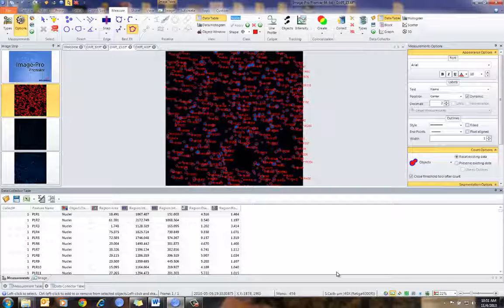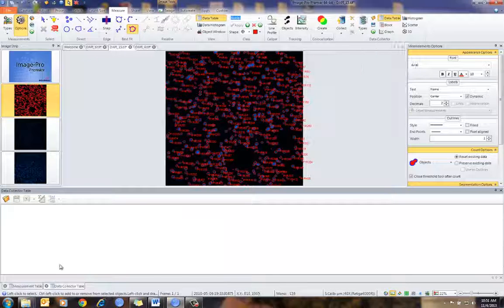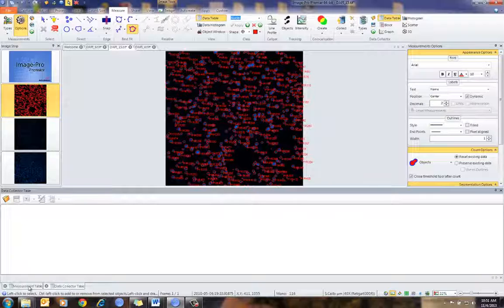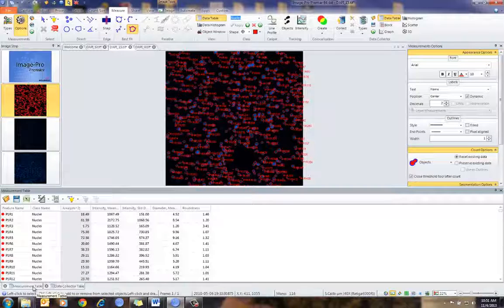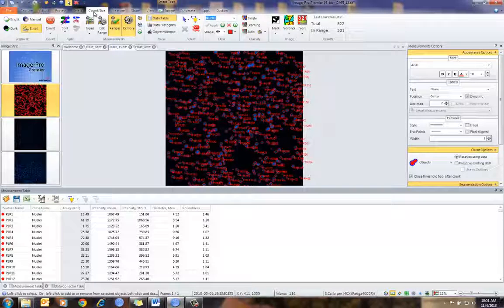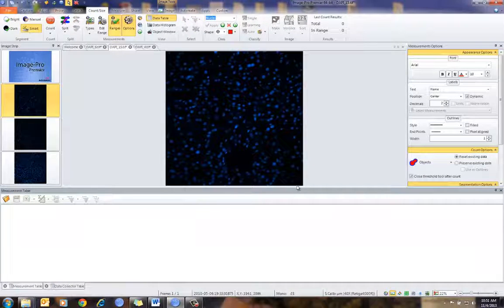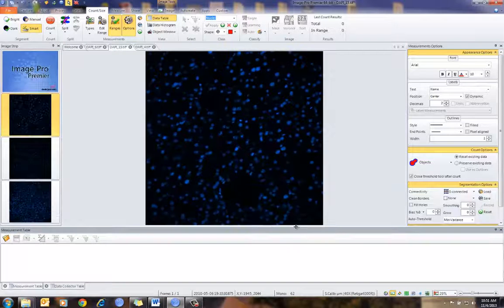Let me show you a couple of different ways about analyzing data. I'm going to clear all the data out — you can see it's now removed all the data from Data Collector. I still have data in my measurements table; I'll clear that in a second. Let's go to Count Size.